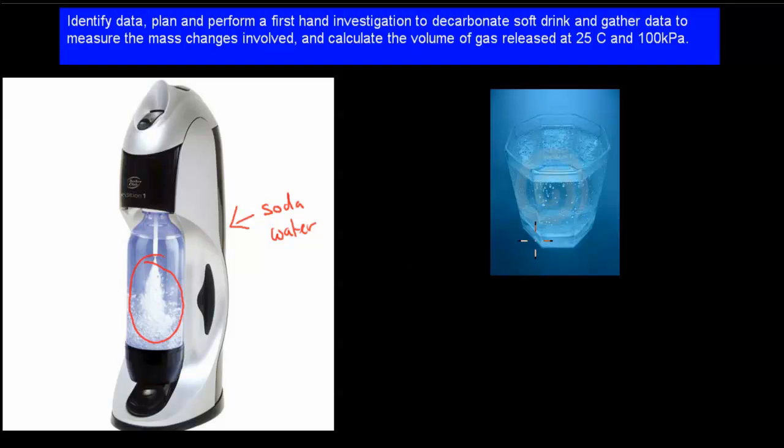And then if we have it standing around, this is how we made it. If we have it standing around, what's going to happen is your bubbles will leave the actual glass, and your bubbles are your CO2. So here, this is how we put it in, and then this is how it leaves again.